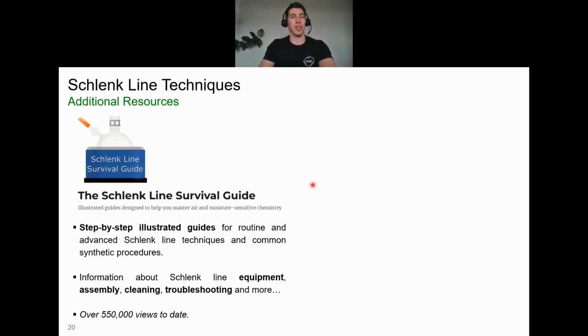So that already brings me to the end of my presentation today. I only had a chance to talk about a few of the key techniques. So if you want step-by-step illustrated guides for routine and advanced techniques and even some common synthetic procedures, then please go to the Schlenk Line Survival Guide to read more about that. There's also questions and pages about cleaning, assembly of Schlenk lines, a lot more detail and links to equipment. So do look at that.